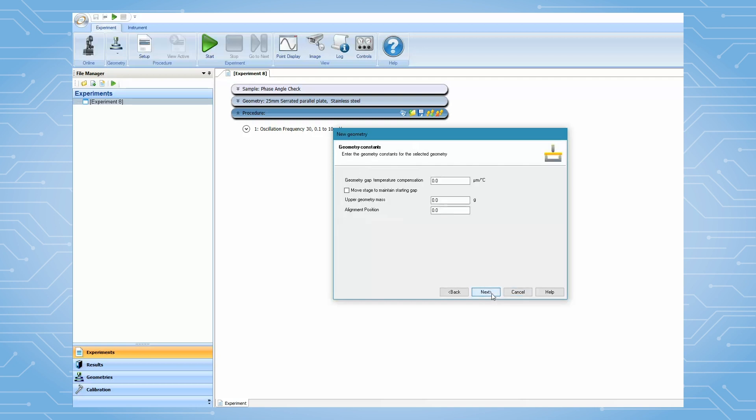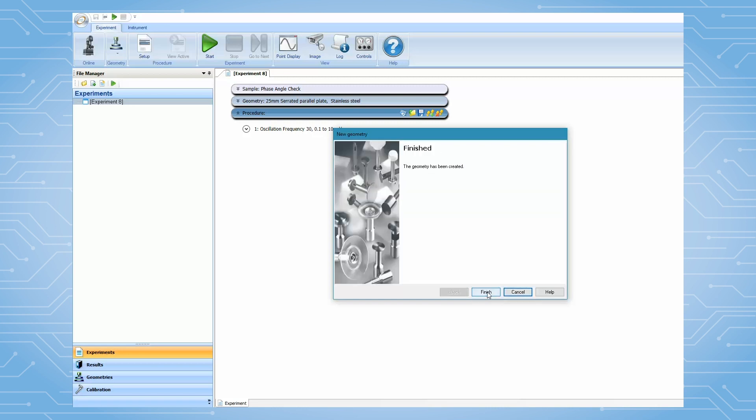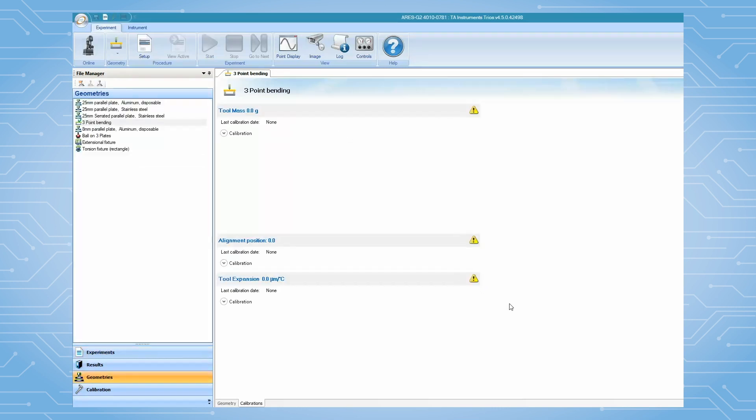Simply click on Next in the next few pages, since we will be entering sample dimensions and performing clamp calibration after the geometry file is created. At the end, click on Finish to create this geometry file.